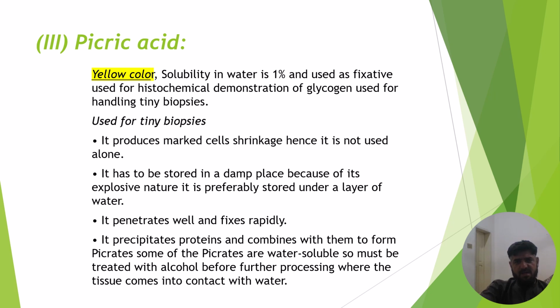There are some advantages and disadvantages of picric acid. It produces marked cell shrinkage, hence it is not used alone. It has to be stored in damp places because of its explosive nature. It is preferably stored under a layer of water. It penetrates well and fixes tissue rapidly.